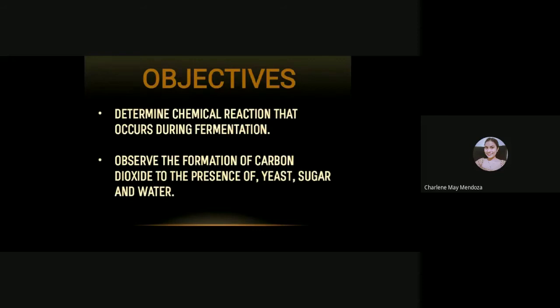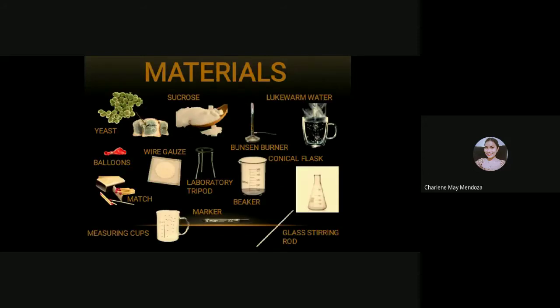In this experiment, we are going to determine the chemical reaction that occurs during fermentation and observe the formation of carbon dioxide in the presence of yeast, sugar, and water. The materials are yeast, sucrose, lukewarm water, Bunsen burner, wire gauze, balloons, match, laboratory tripod, marker, beaker, glass stirring rod, measuring cups.